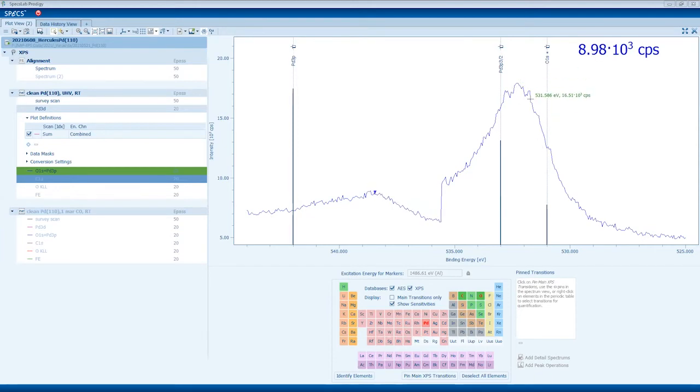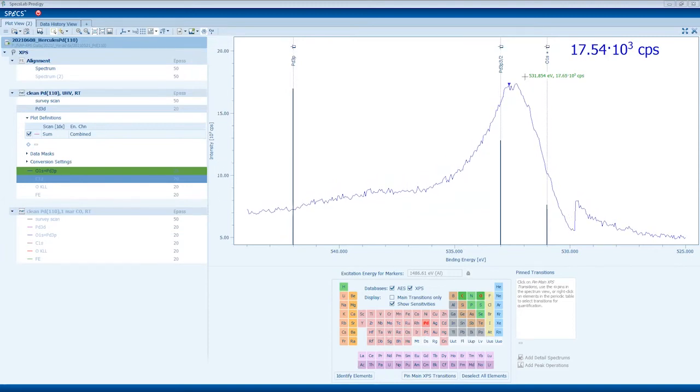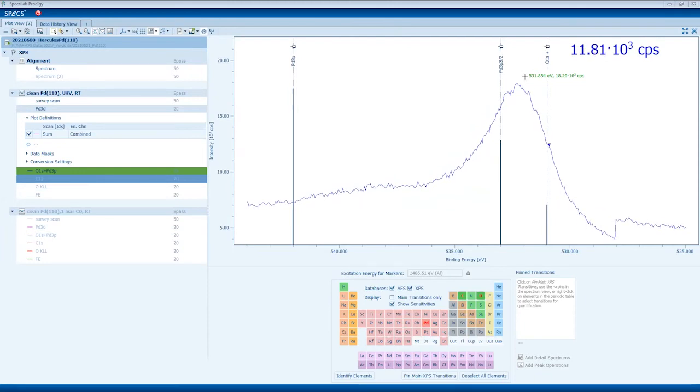But the adsorbed species, they should somewhere overlap with this. It will be quite difficult. But we have a carbon 1s spectrum, which will give us the same information. So you will reduce the number of scans. Yeah, I reduce it.